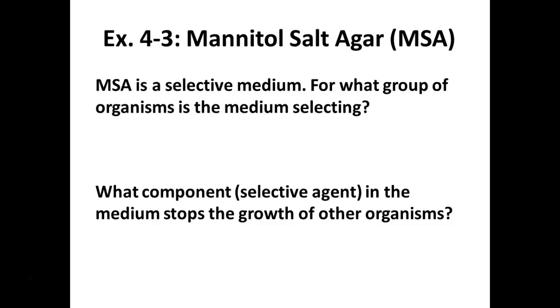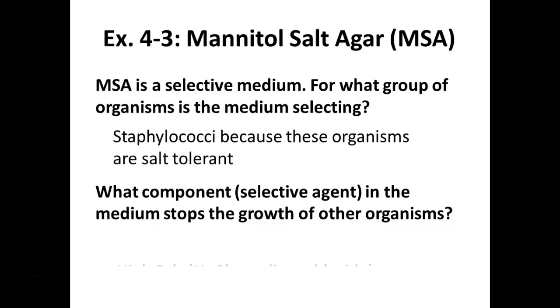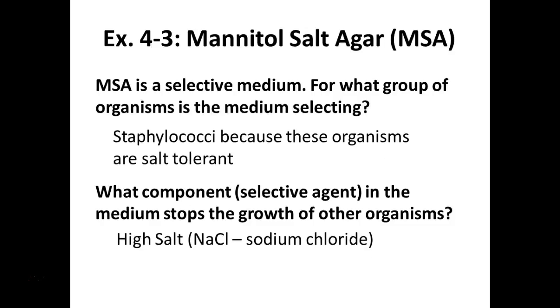It's salty, right? It's more salty than most media. It has a higher than normal salt concentration. So if your organism grows on these plates, y'all, it isn't necessarily a Staphylococcus. But what you can know definitively is it is salt tolerant for high levels of salt, which of course most Staphylococcus are, and that's why we use this media.